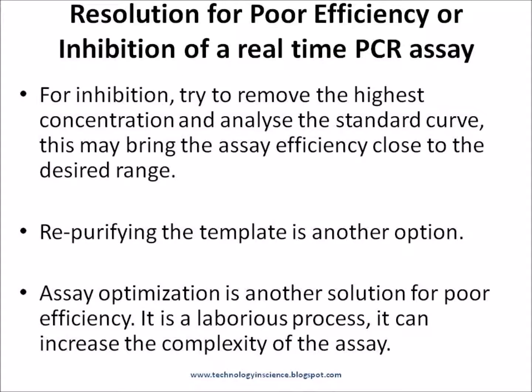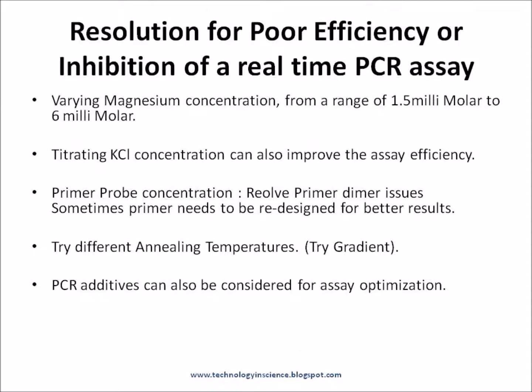Repurifying the template is another option and can be done without much difficulty. Use enough washing steps to wash off chaotropic salts, which can inhibit the reaction. Assay optimization is another solution for poor efficiency, though it is a laborious process that can increase assay complexity. Varying magnesium concentration across a range of 1.5 mM to 6 mM can improve assay efficiency.